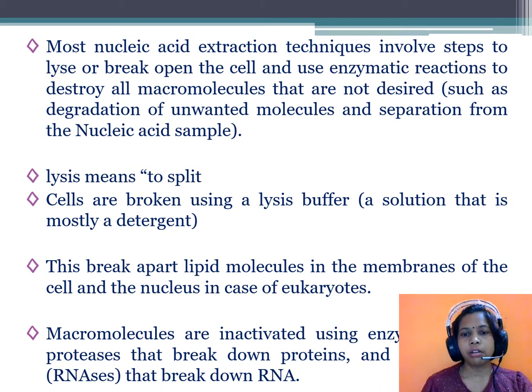Another step for the lysis is the use of enzymes. Macromolecules are inactivated using enzymes such as proteases and ribonucleases. Proteases break down the proteins, and ribonucleases break down the RNA.